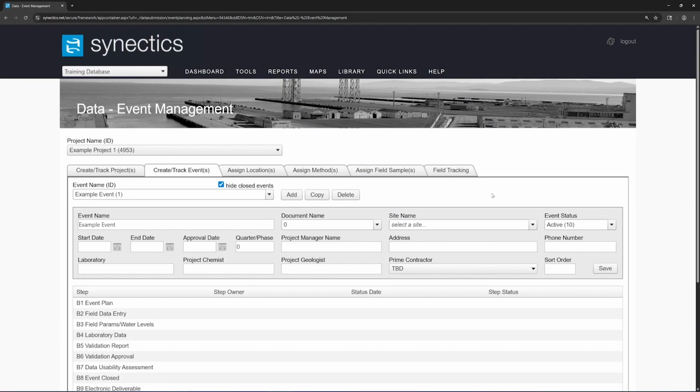The event planning tool helps manage large datasets by allowing you to create event tracking reports. These reports update in real time and use color coding to indicate the status of each planned sample. They track the event to ensure samples don't slip through the cracks. Both chemistry and non-chemistry data can be planned and tracked, and it is recommended to plan all applicable data types.